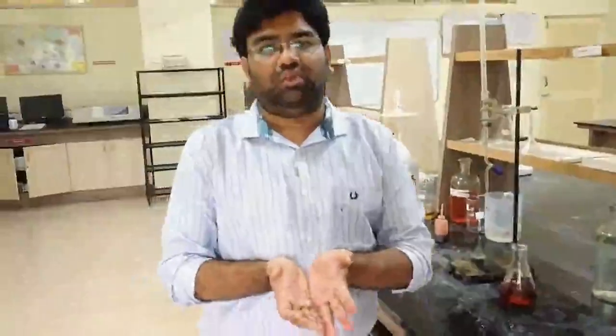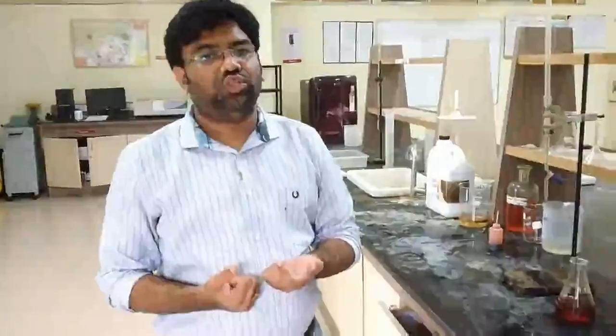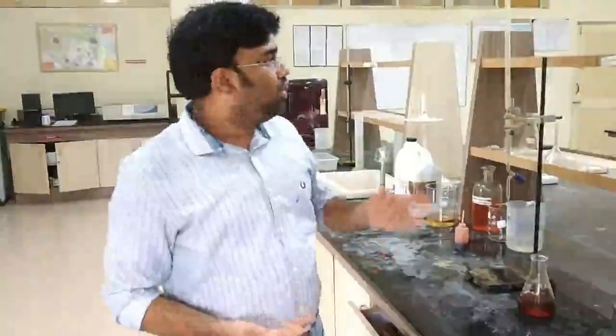The formula remains same. N1V1 is equal to N2V2. And here N1 is the normality of potassium dichromate, which is 0.25 normal. V1 is the volume of potassium dichromate, which is 10, right? And N2 is the normality that we have to find out of the titrant, which is unknown, and V2 is here now 24.8, right?